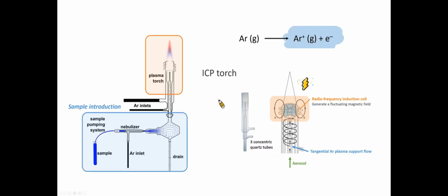An ICP offers several advantages over flame and furnace atomization sources. One is that it is so hot that it leads to a more complete atomization and leads to the formation of many excited state atoms. A second advantage of an ICP is that all of the elements can be measured simultaneously. All metals in the sample will be atomized at the same time, and all are emitting light.